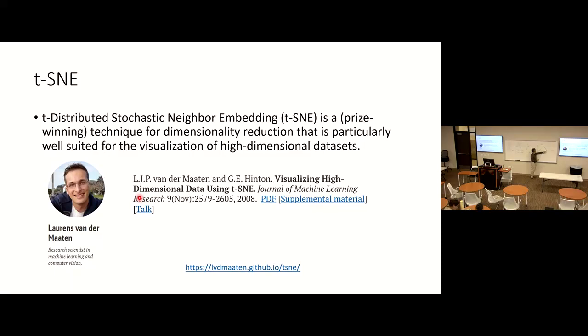But when I redefine the distance, I project this onto here. This is the same probability. But when I generate the data, I use this longer distance, Dij, which is longer in the T distribution.